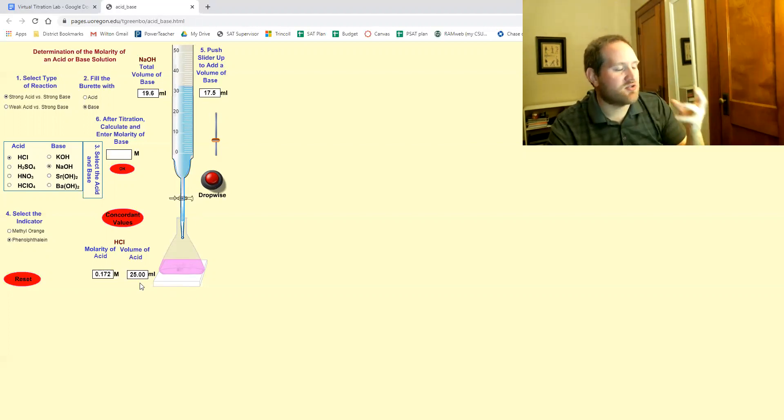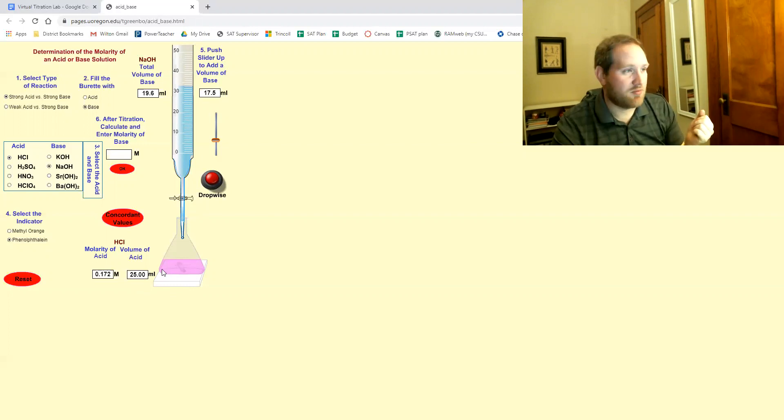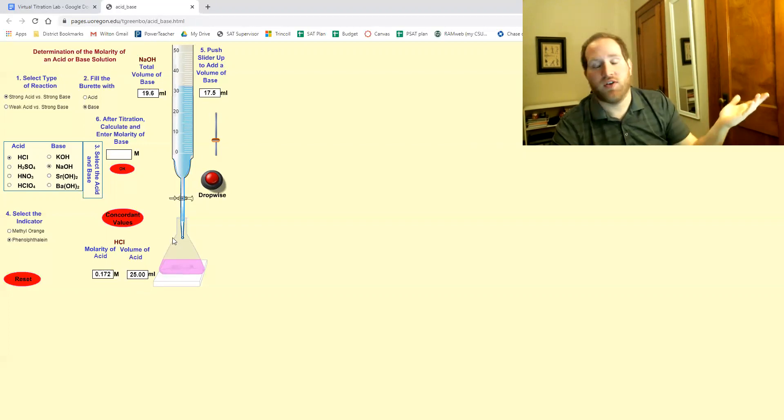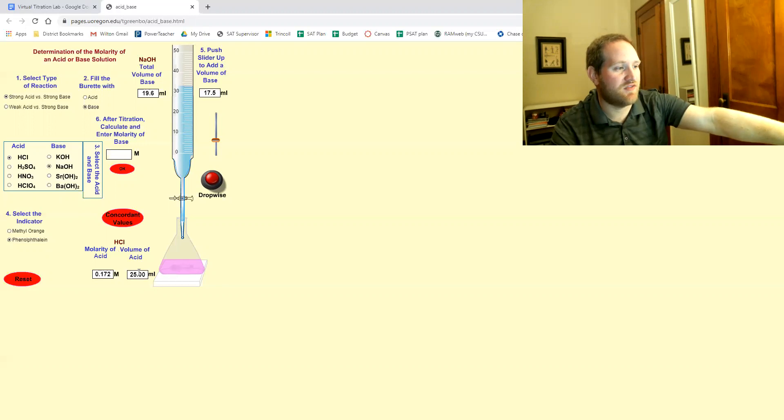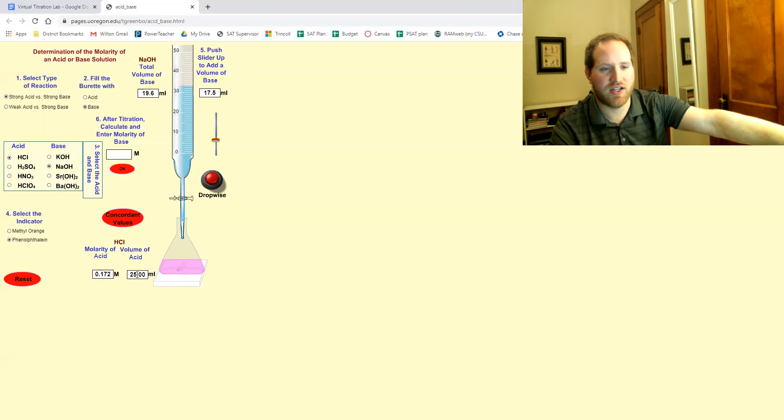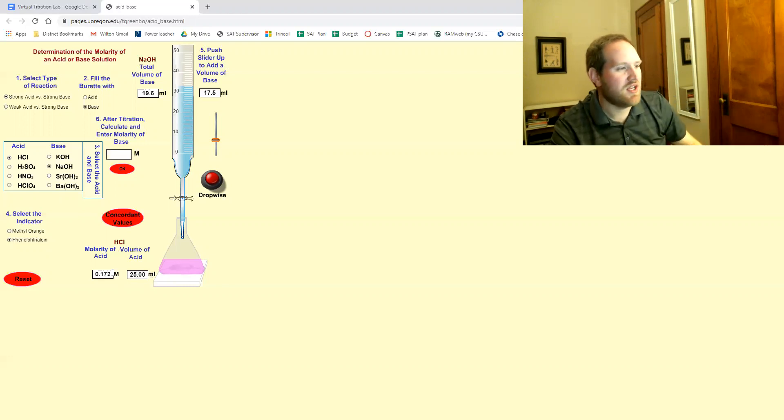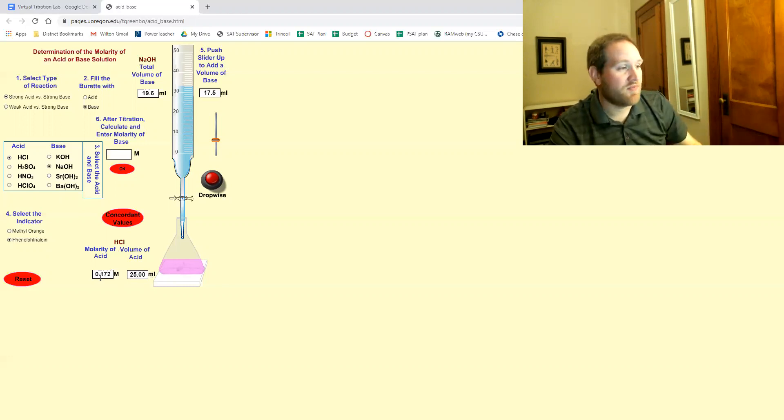And here's where we're going to take our second data point. Well, third, I guess, if you consider the molarity of the acid and the volume of the acid should have already been recorded. I think I forgot to mention that, but you could even do it now. It doesn't matter.